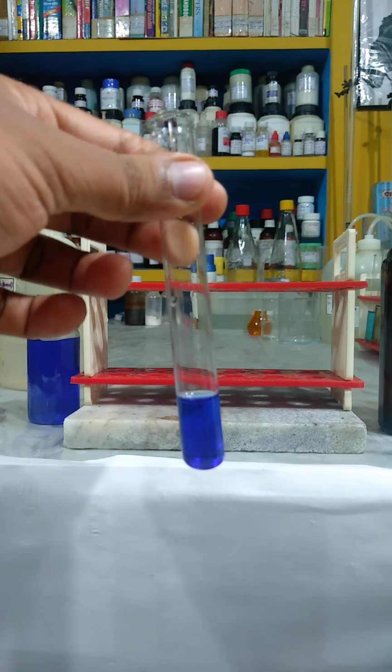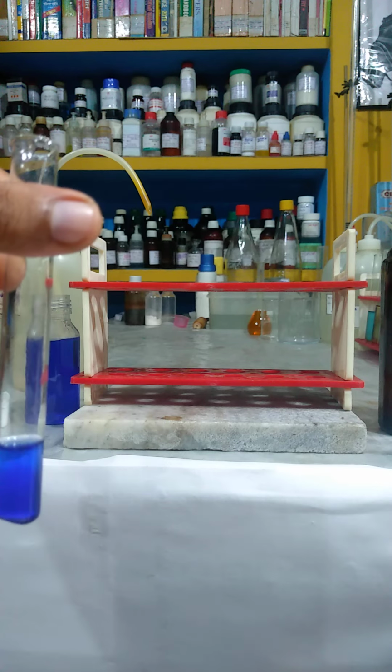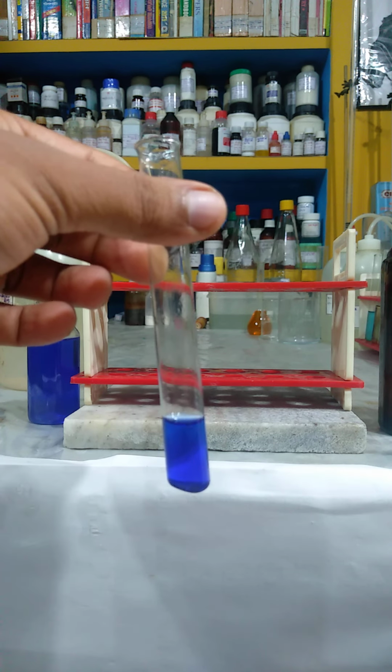You may identify Cu2+ radical by the color.